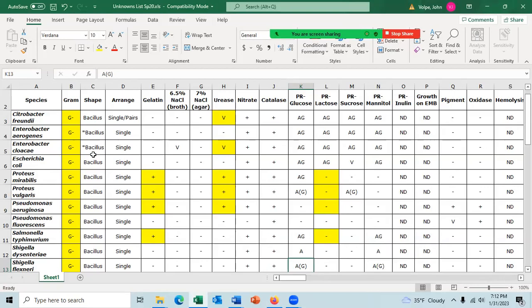If it's a freshly growing solution, meaning we're growing the bacteria in a liquid culture and it hasn't been sitting there for a while, the bacilli will take on the shape of a coccobacillus. However, on most solid media, the bacteria grow a little slower and they tend to be more bacillus-shaped, especially if the culture is not freshly grown, meaning it's 2 days old or older. It'll take on the shape of a bacillus.